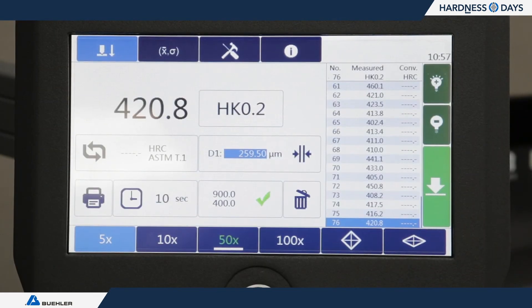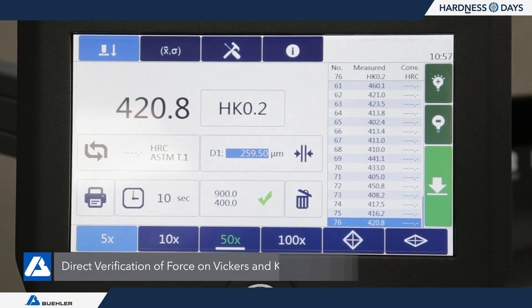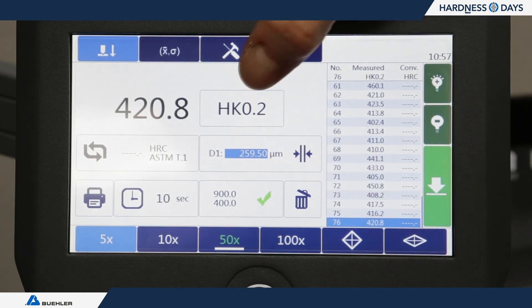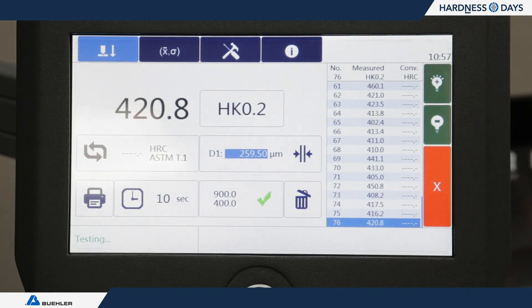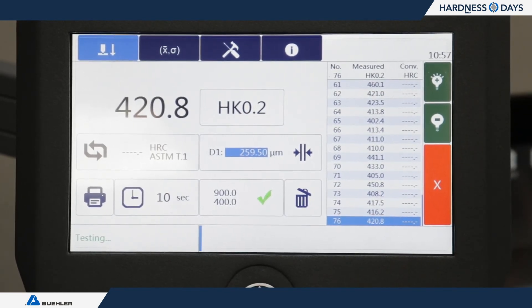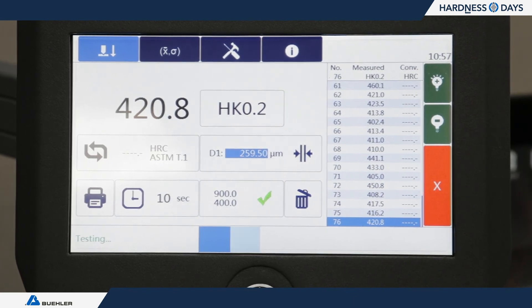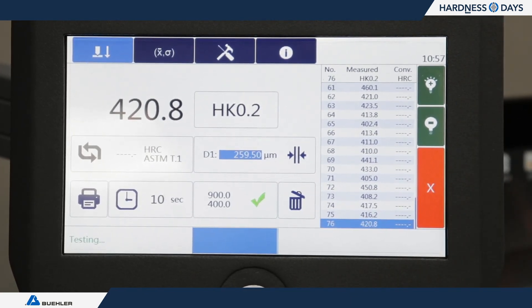The next section of E92 is to verify the forces. We're showing a scale here, which is a simple way to check. I set the machine at 200 grams and tell it to make an indent. Looking at the output of the scale, it's reading 199 grams — which is in compliance with the standard.